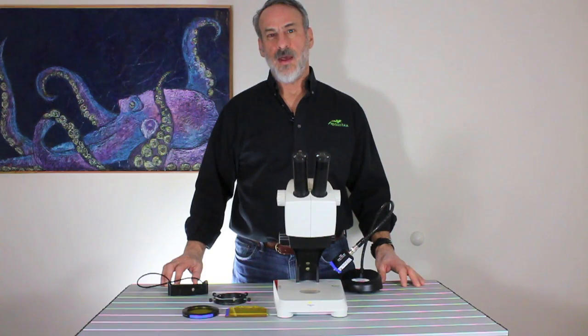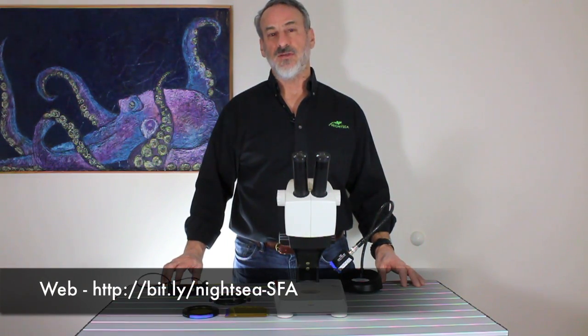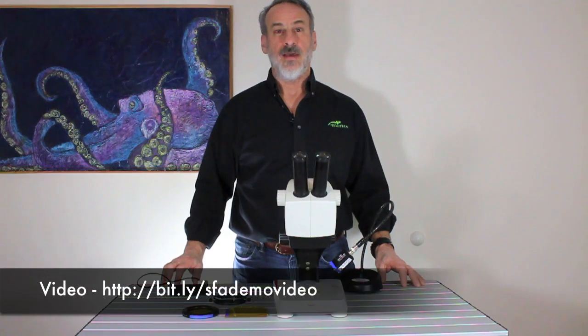I want to show you a new microscope adapter for use with NYTC's popular Model SFA Stereo Microscope Fluorescence Adapter System. In case you're not already familiar with the system, I suggest you check out the website and the demo video at the addresses shown on the screen.